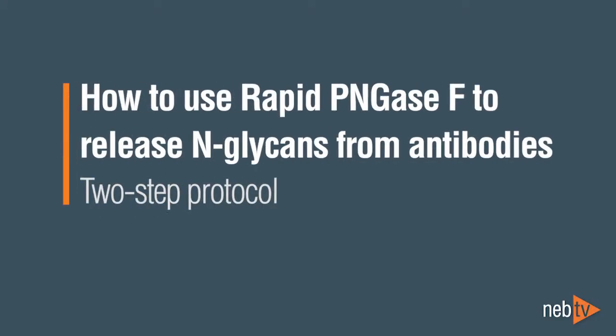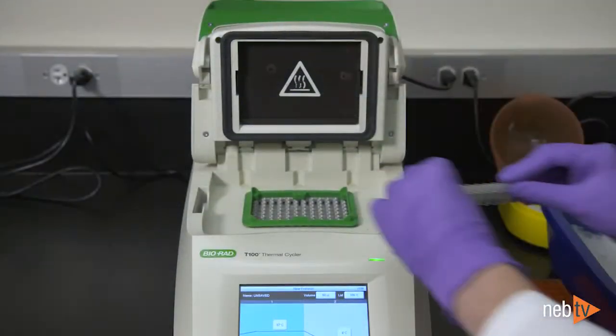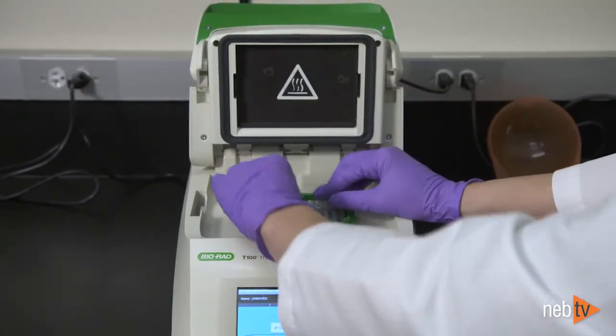The following deglycosylation protocol is recommended for use with New England Biolabs' Rapid PNGase F. Note that either heat blocks, as shown in this video, or a thermocycler may be used with this protocol.